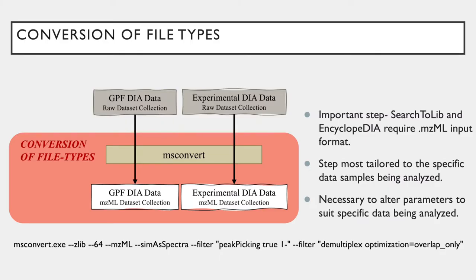As previously mentioned, the first step of the Encyclopedia workflow is the conversion of files from .raw file type to the .mzml file type, which is an important step as Search2LIB and Encyclopedia both require .mzml input file types. While file type conversion is the simplest step, it is also the step that is most tailored to the data input. More specifically, the parameters used by msconvert to convert the files will vary between different input data samples and need to be set by the user accordingly.